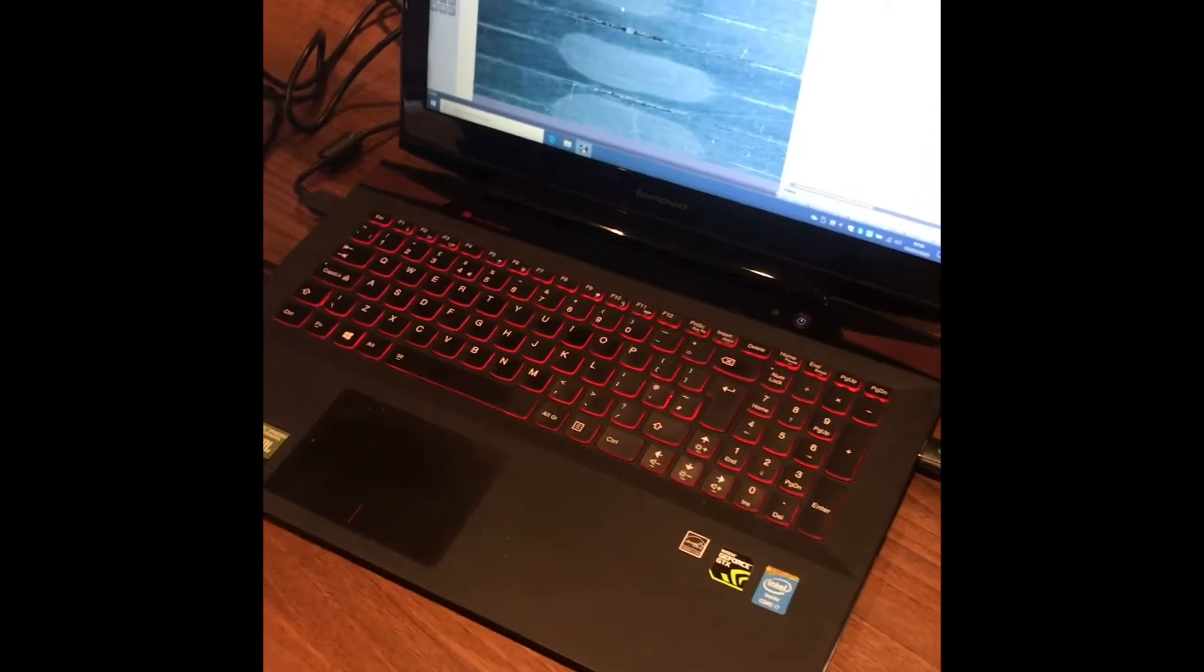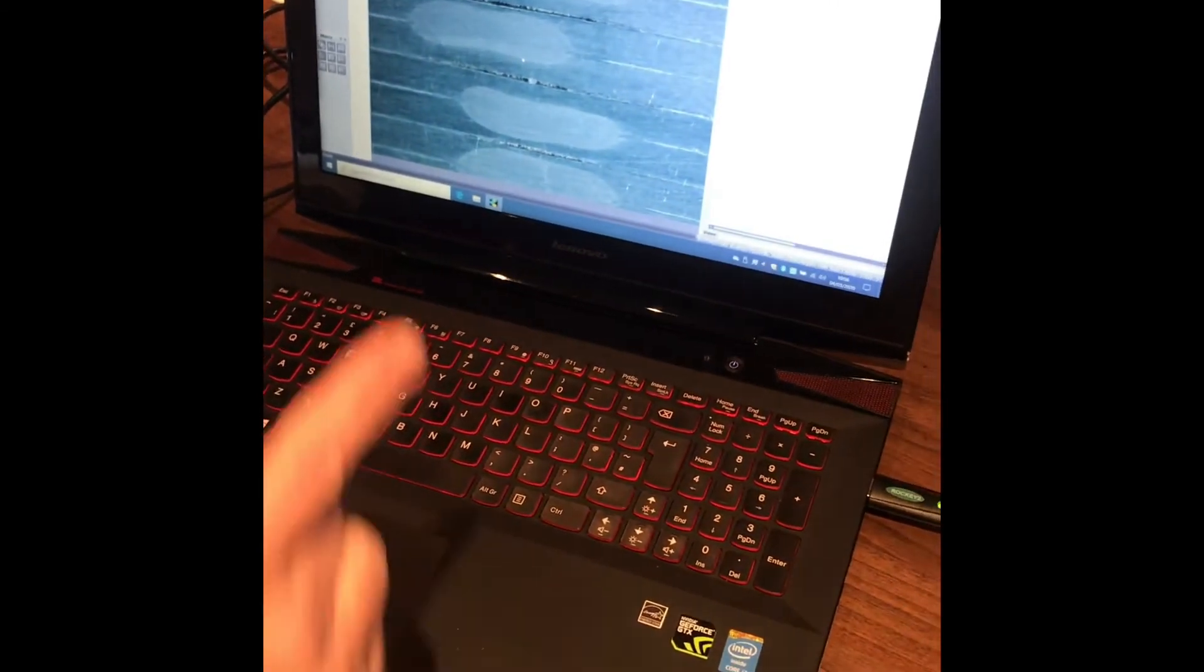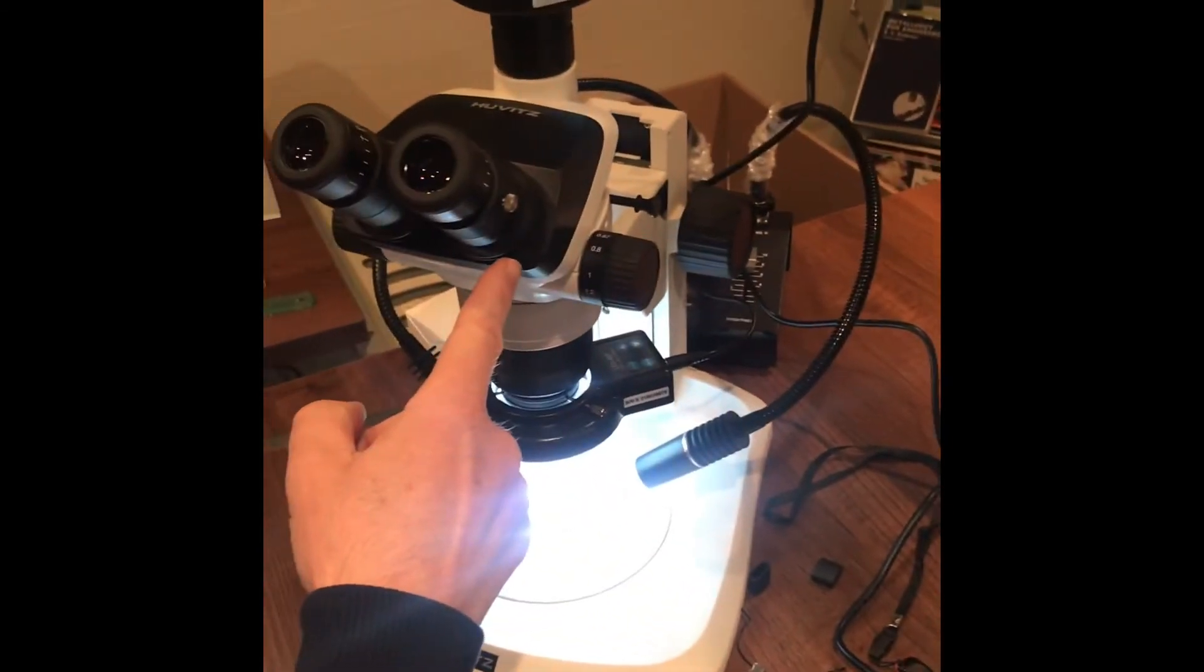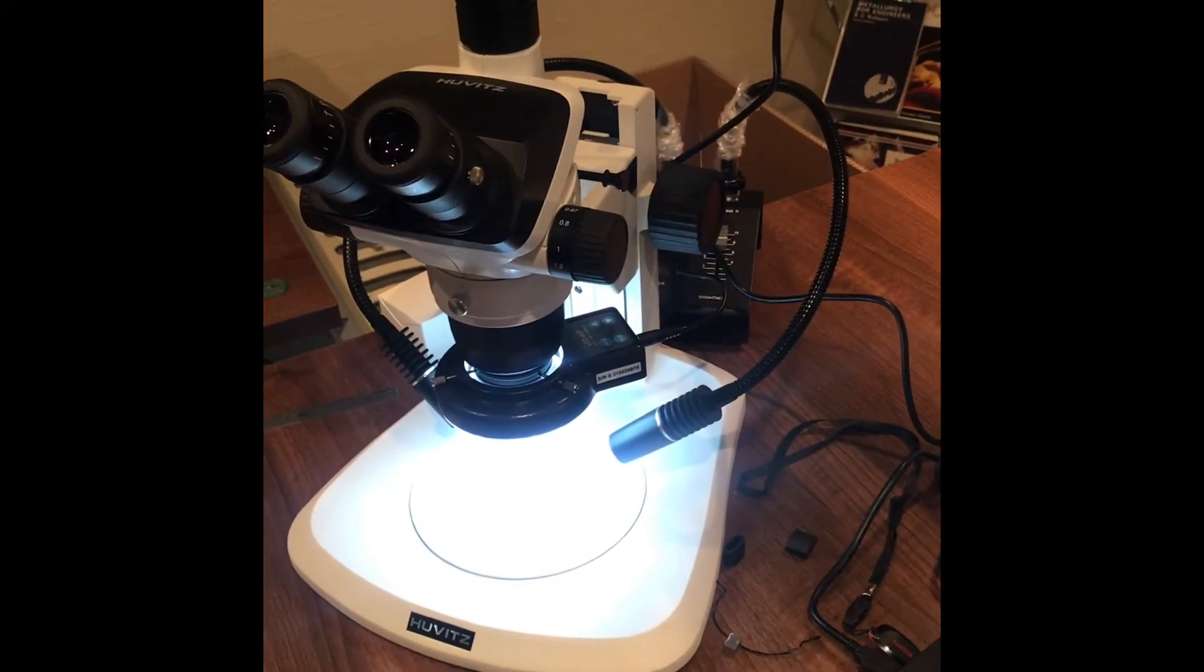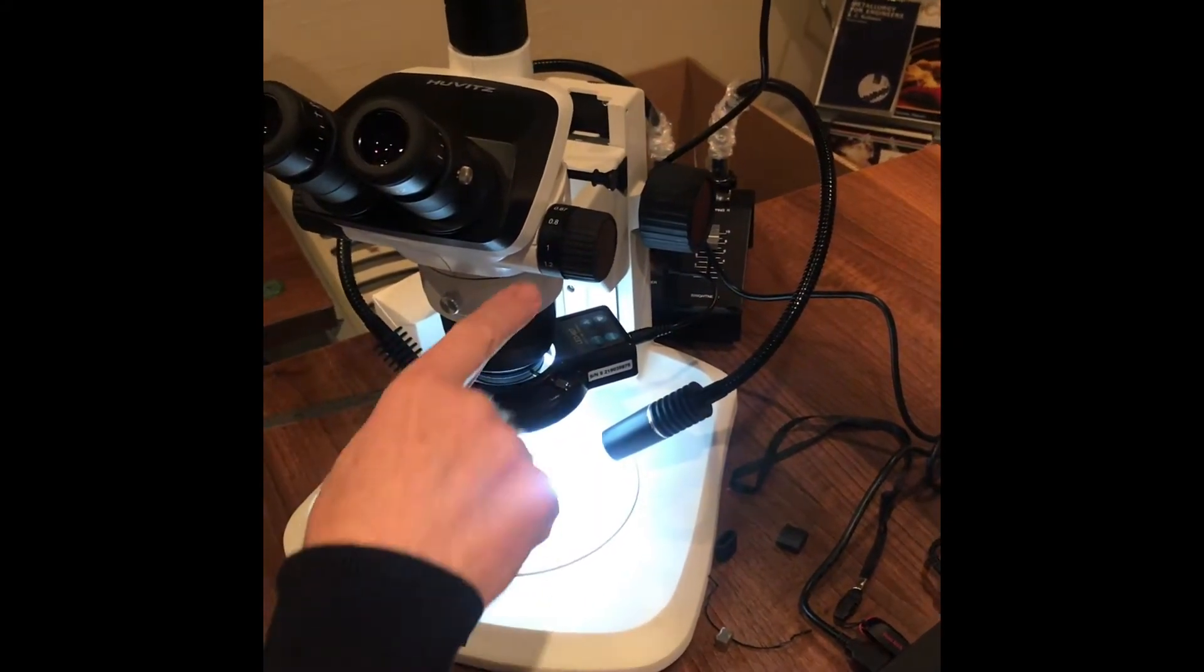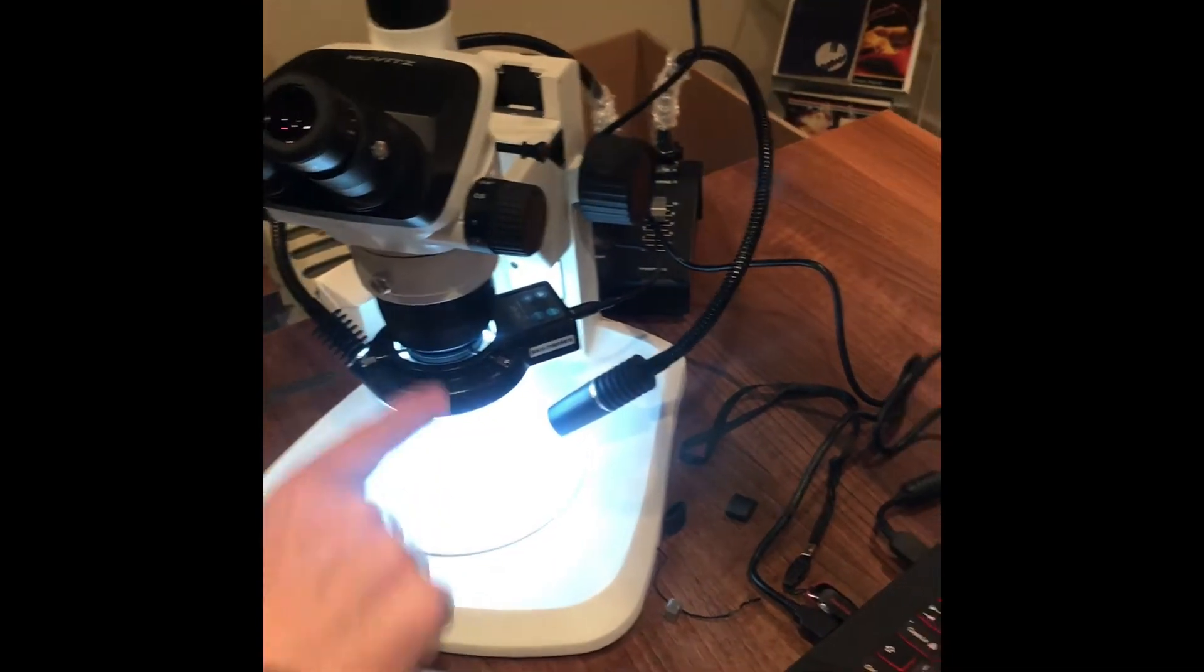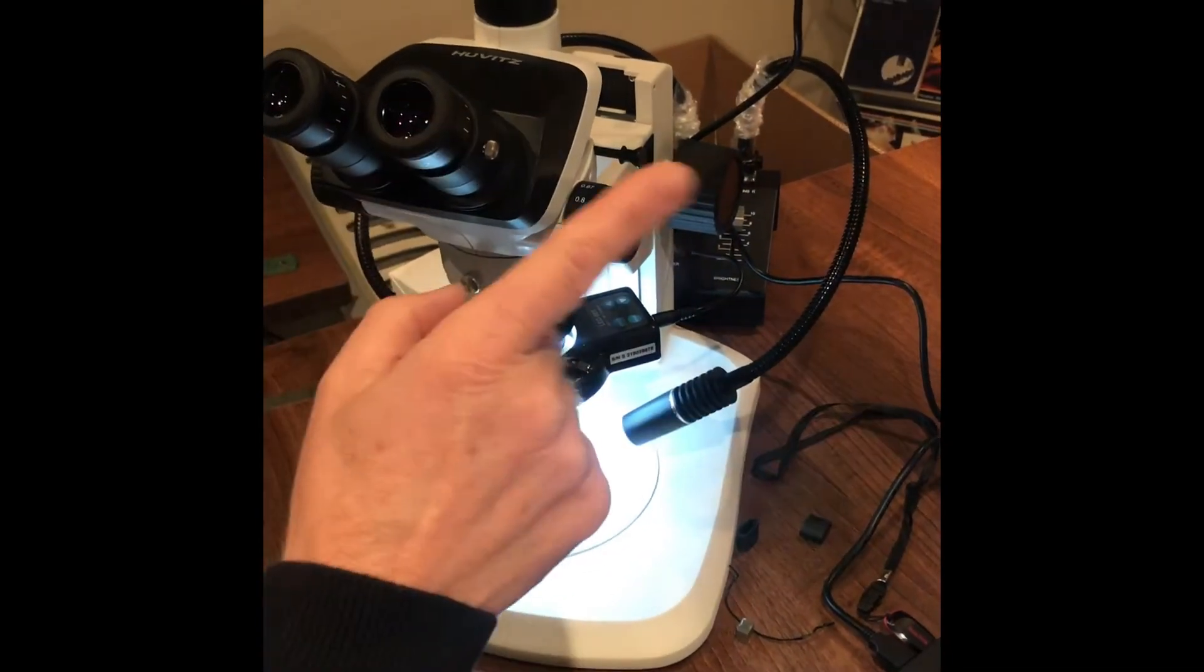Okay so we have the same customer sample. We've got four spot welds on here. We're using the magnification up to 45 times magnification but we're currently working at 10 times using the 1 times and 10 times eyepieces.